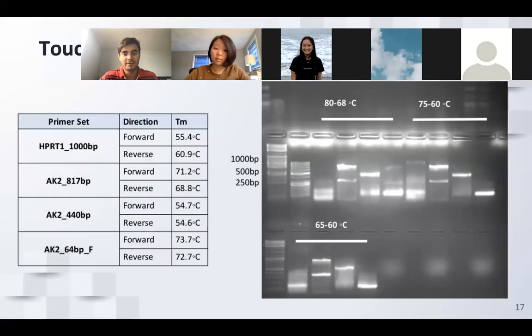But when you look at the final results like this, this is a PCR result after, I don't remember exactly, probably 25 or 30 cycles here. So what happens to the intensity of the bands when I am at cycle 15, for instance? What do you guys think the intensity would look like at cycle 15?